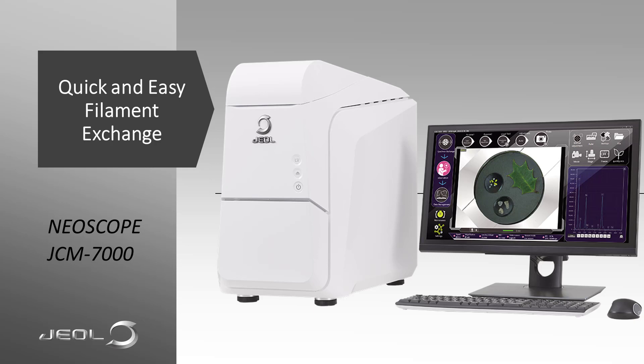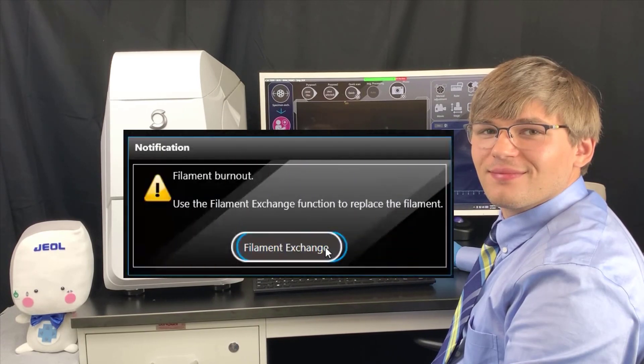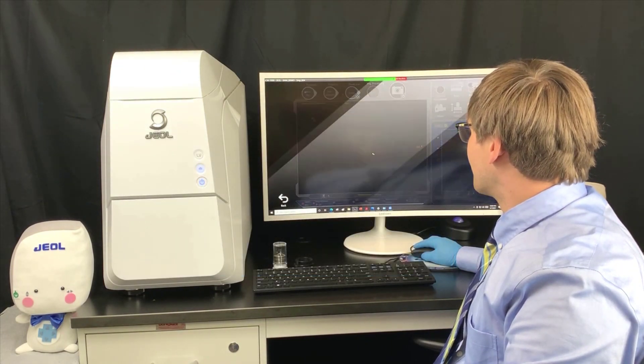Today we will show you Joel's solution for quick and easy filament exchange, from filament burnout to beam-on in about six minutes. When the tungsten filament burns out, this message will appear. Click Filament Exchange to bring up the Filament Exchange window.